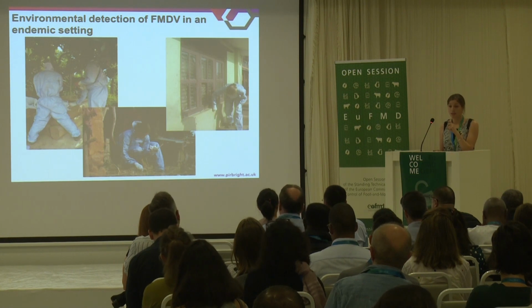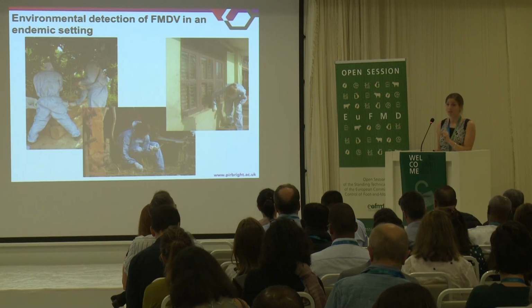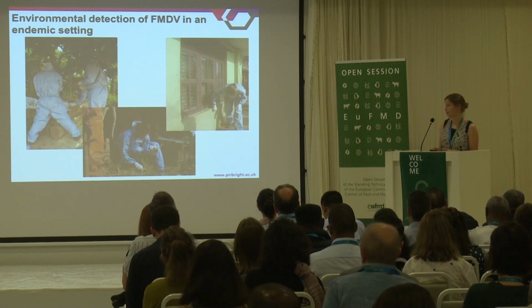The media then is our sample, and that was put into lysis buffer immediately at the point of sampling, and these samples were then shipped back to Pirbright for testing. The transport in lysis buffer did mean that we could do no analysis using viable virus, so all of this is to do with PCR analysis.